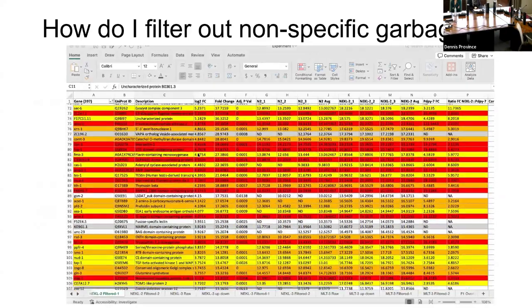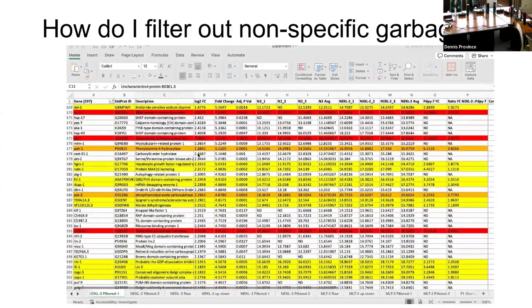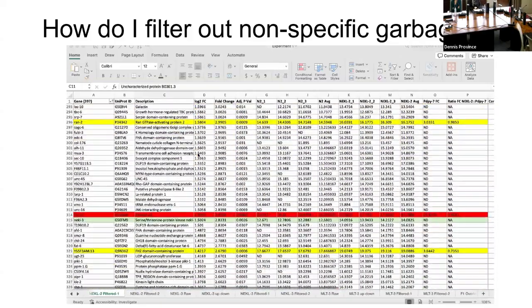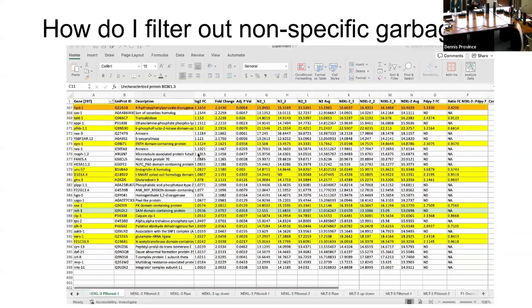And then I annotated everything based on that color scheme I was telling you about, right? And one thing I got to say is, you might think, okay, as we go down, their fold change is going down. That's how it's arranged. But look, there's NECL 3. That's real. That's only like 2 points. And look at this, barely hanging on to the bottom is MOLT3. This does not show up by accident ever. So here's a perfectly good thing that I know is real at the bottom of my list. It tells me I can't throw off things that are below that. And that's pretty much the tail end.